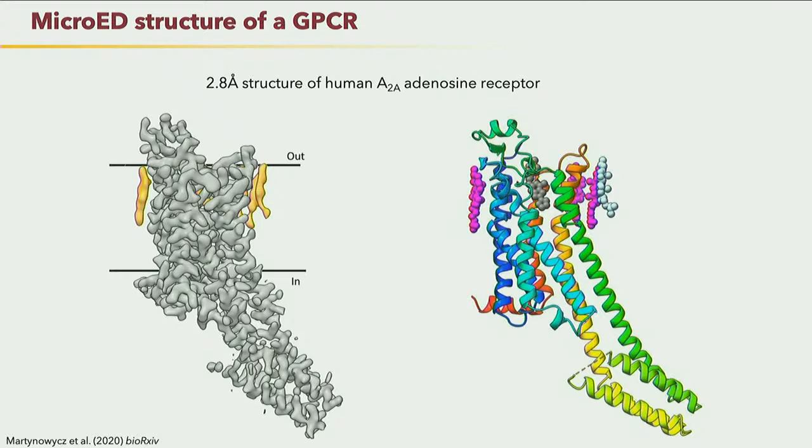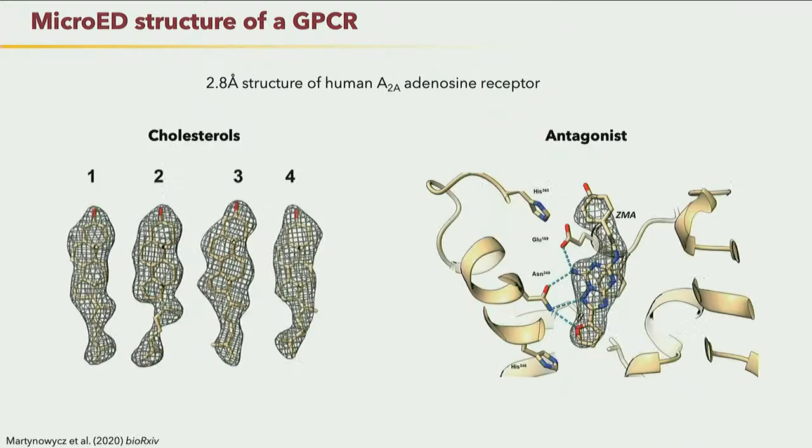Now the resolution for this is not as good as what was done for the XFEL, but the thing to remember, this came from one single crystal, whereas the XFEL shot tens of thousands of crystals to get this structure. So there's pros and cons. Resolution is not as good, but it didn't take quite as long, and there's only one crystal versus an entire team going to the XFEL and spending a long time and a lot of sample. So there's pros and cons to both approaches.